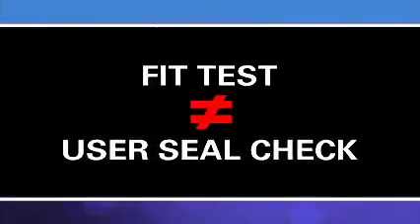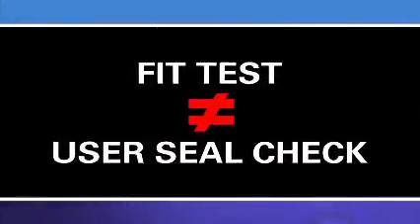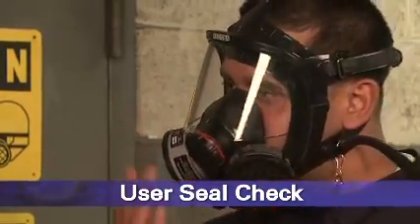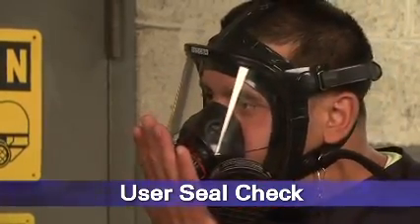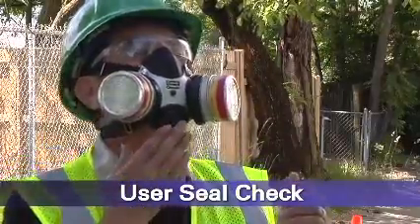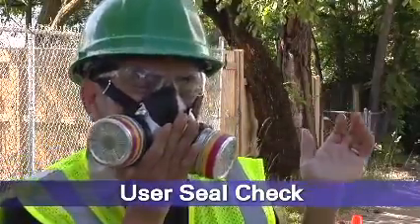A fit test should not be confused with a user seal check. A user seal check is a quick check performed by the wearer each time the respirator is put on. It determines if the respirator is properly seated to the face or needs to be readjusted.